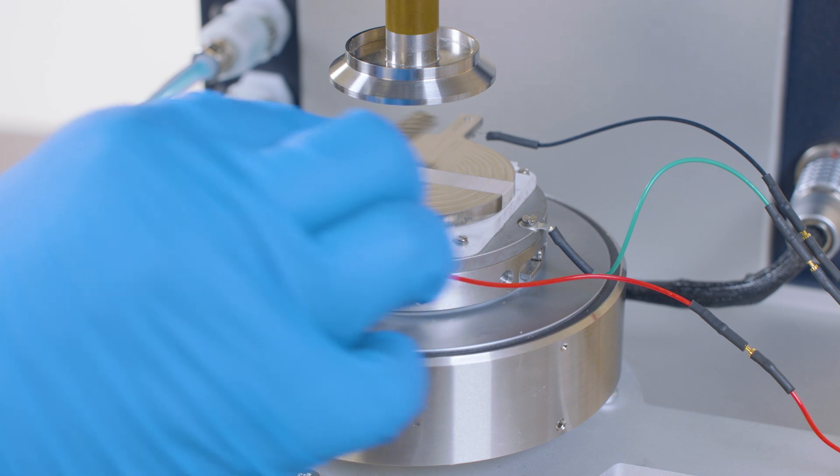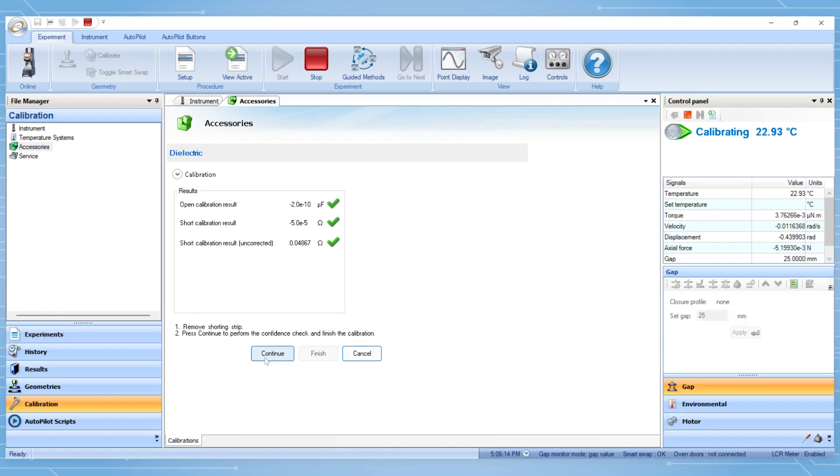When prompted, remove the shorting strip and press Continue to proceed to the confidence check. Green check marks indicate that the calibrations and confidence check have passed.